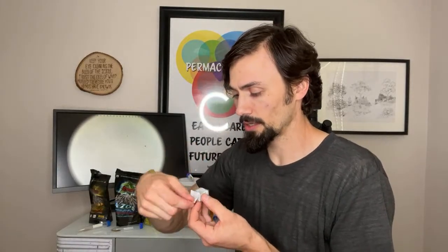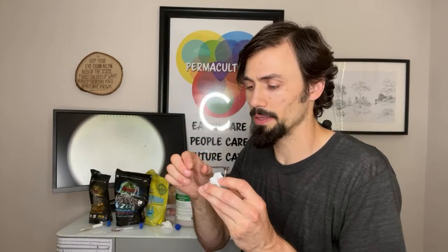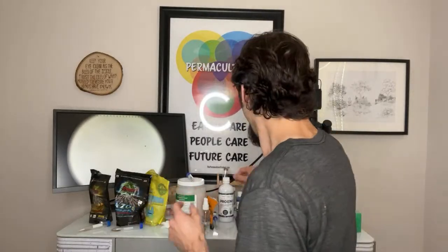And then our cover slips. Cover slips are often going to stick together, and you have to be really careful with them because they're so thin, it's almost like they're made of sugar, but they're not, they're real glass. And so they cut you. Not fun.